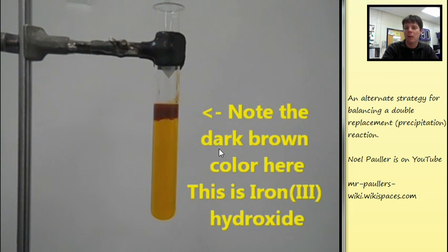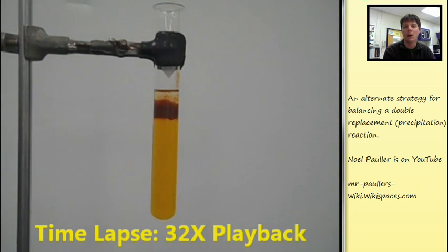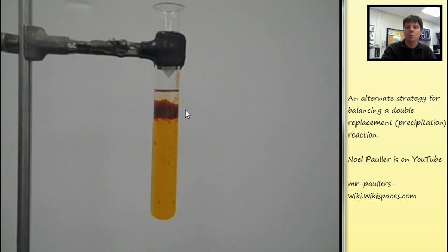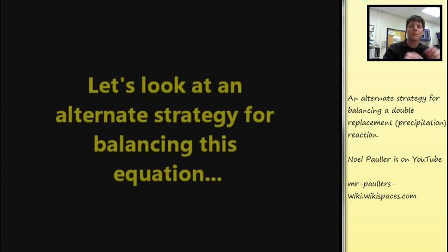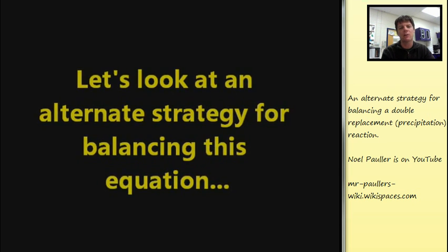Note that there's a dark brown color that's forming right here. This is the formation of a new compound. This is iron 3 hydroxide, FeOH3. Please note that there's a clearing taking place up here. We can see that the iron hydroxide is actually falling or precipitating.